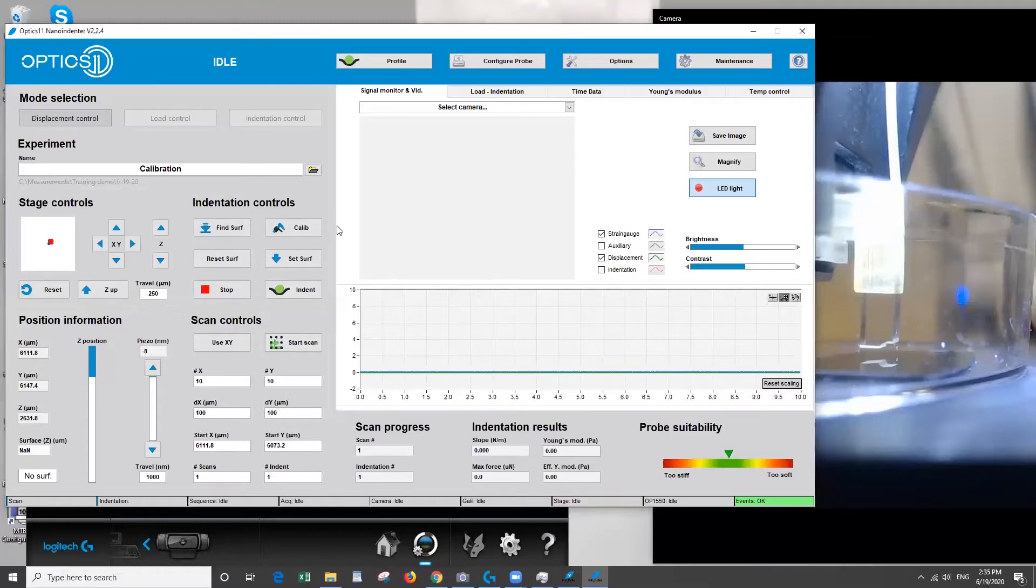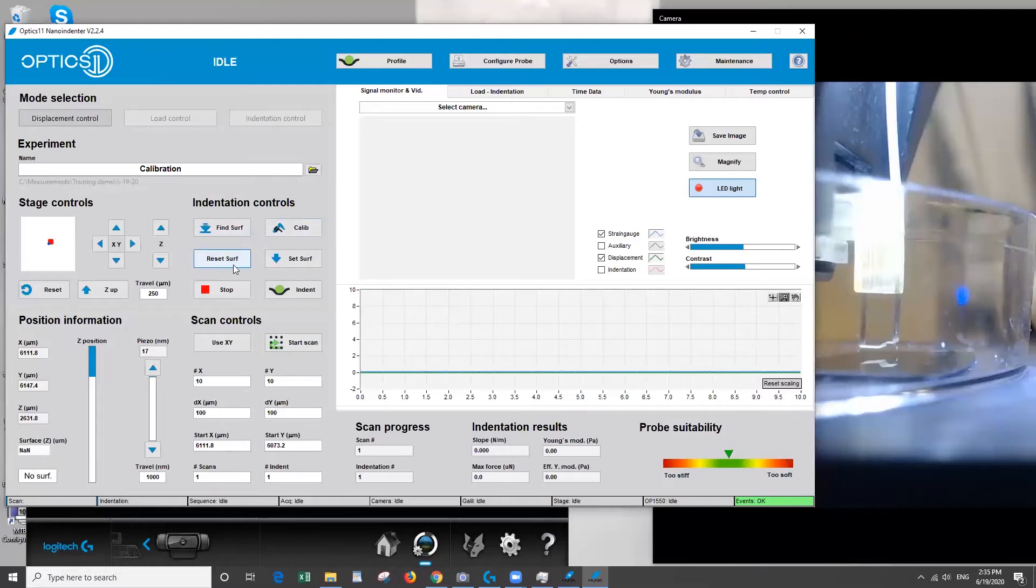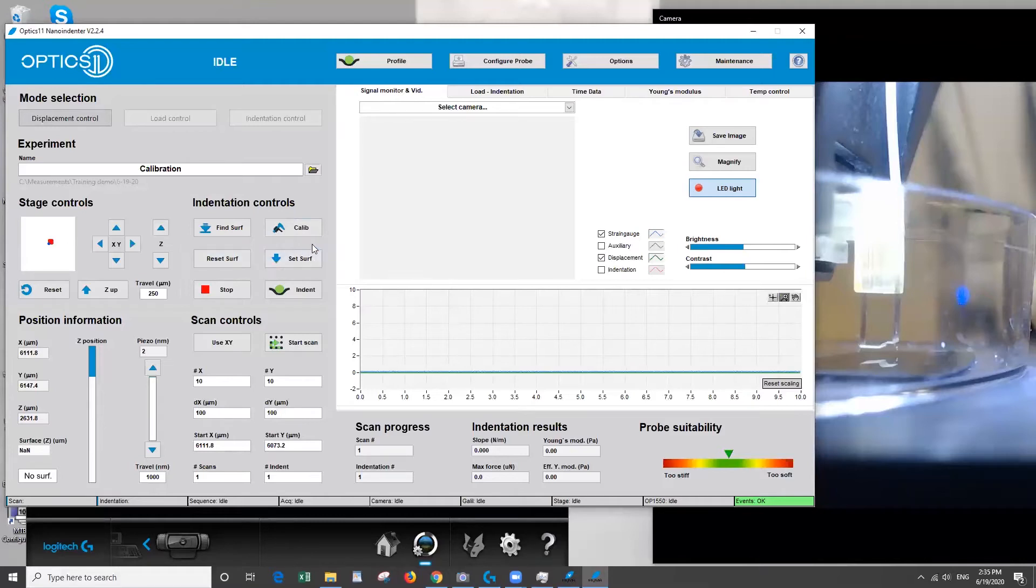Okay so to do that we have some controls here so usually we'll use this find surface button to automatically detect the surface and it will mark where the surface is and set that here. Okay this is for a manual approach so if you're going to lower it a little bit at a time until you decide you found the surface then you can set or clear the surface into the software.